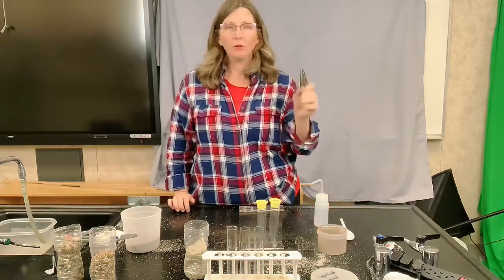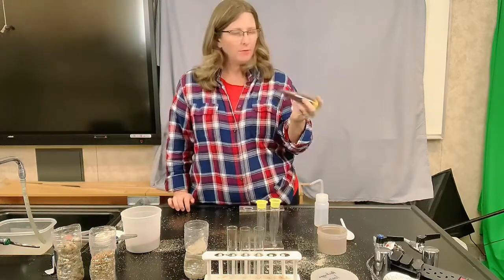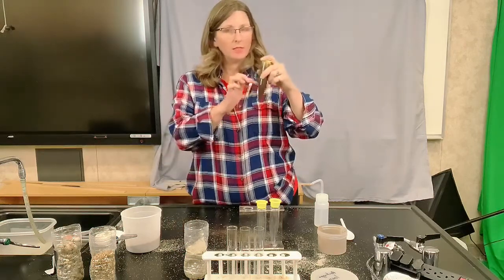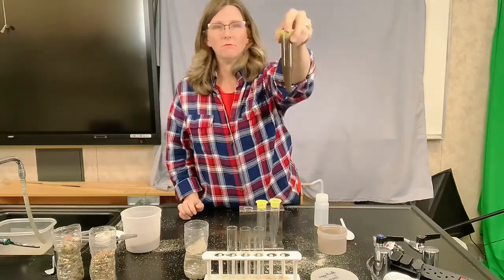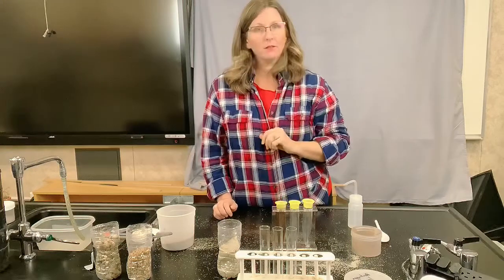They'll settle overnight really slow. It can take 24 hours. And there we go. They will fall down on the top. So then we'll see a nice layered system when we come back tomorrow. And right now it just looks like muddy water. And then overnight it will look different.